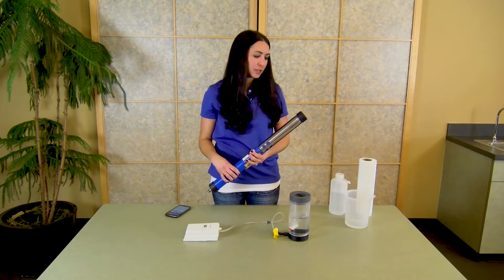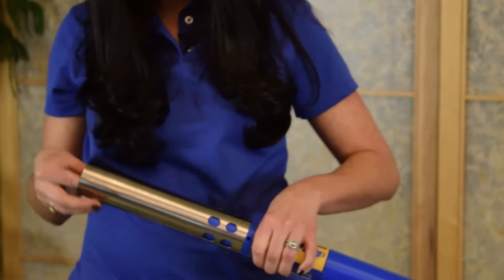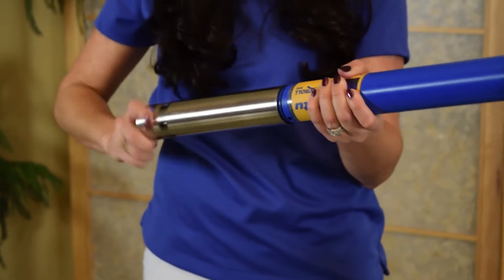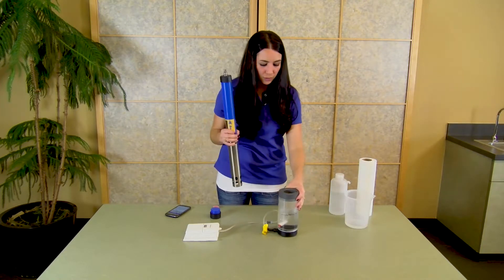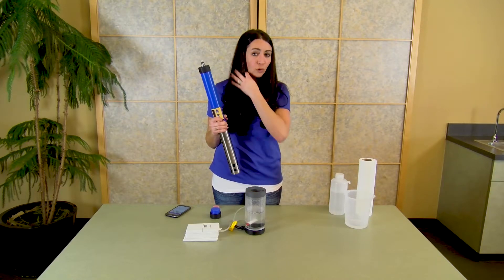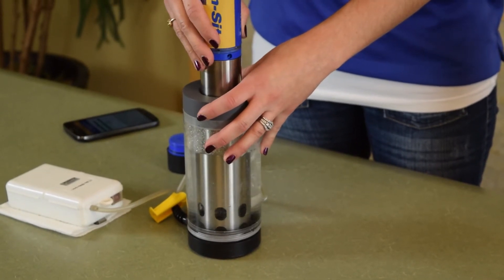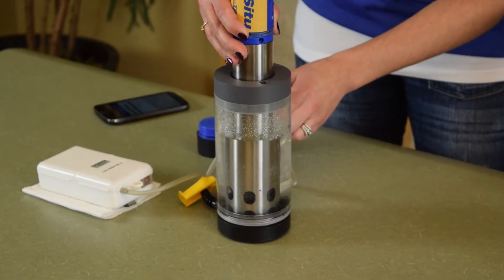If you prefer an air-saturated water calibration instead, you will remove the end cap of the instrument and change the restrictor so it's in deployment mode. You will use your saturated bubbler, and it's important to make sure that it bubbles for five to ten minutes before you begin your calibration. Insert the instrument with the restrictor on into the calibration chamber, making sure that the sensor itself is fully submerged under the water.